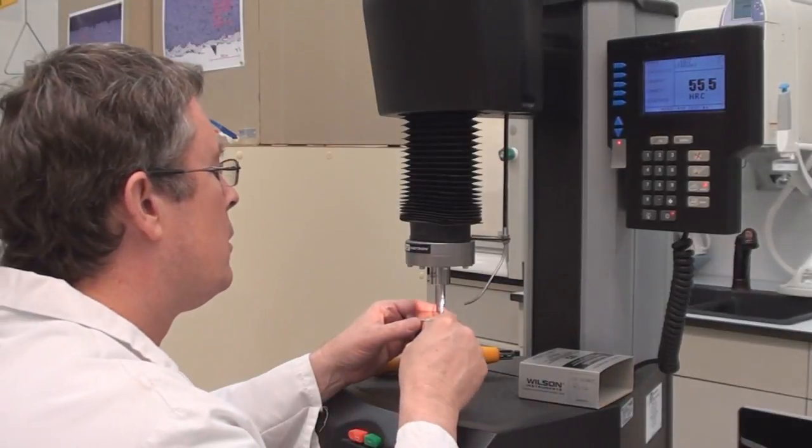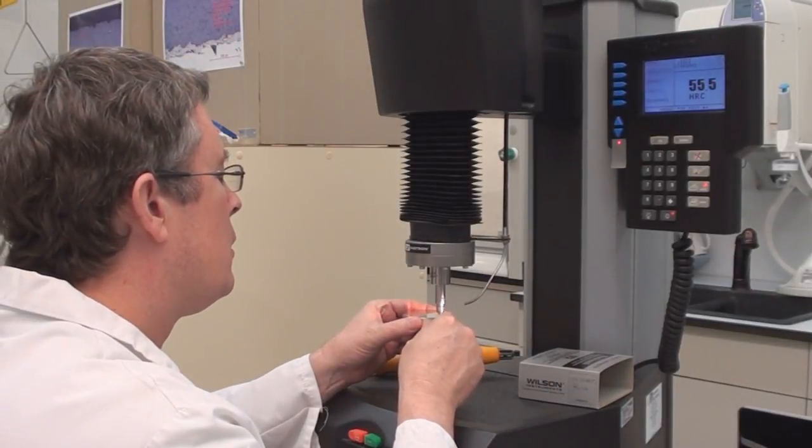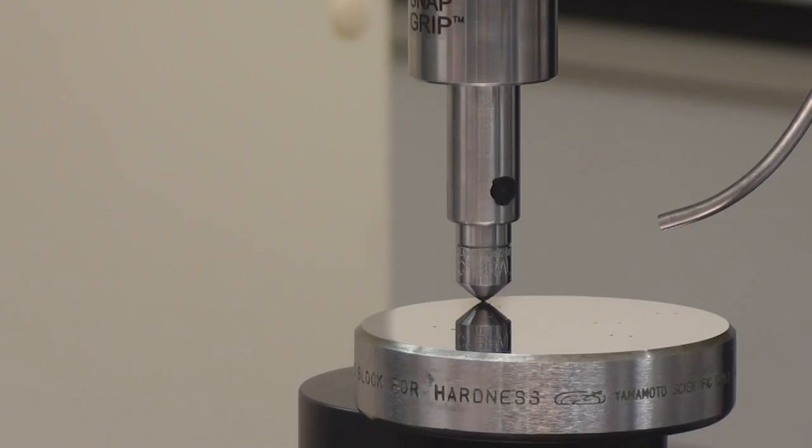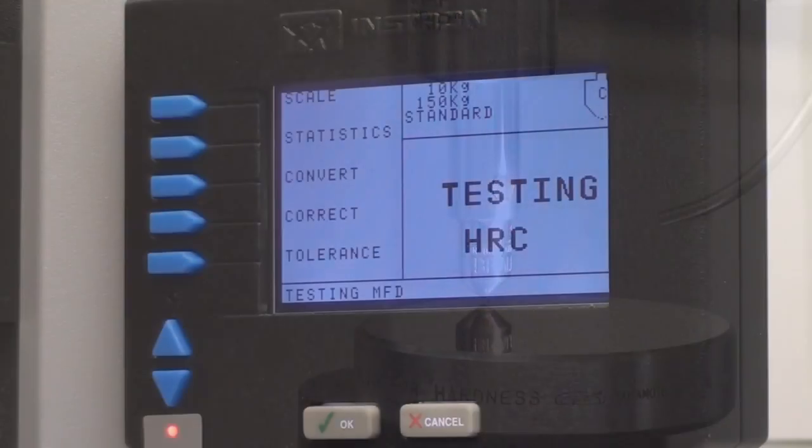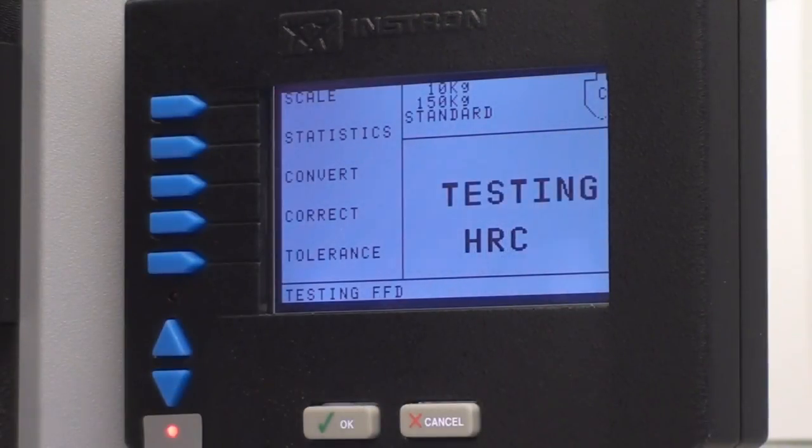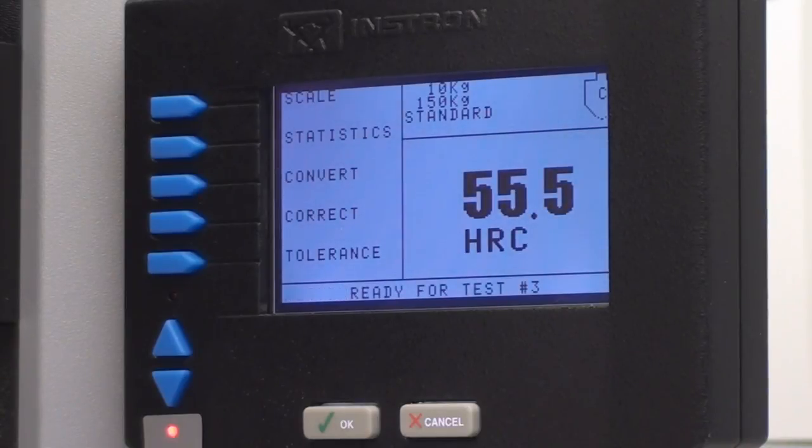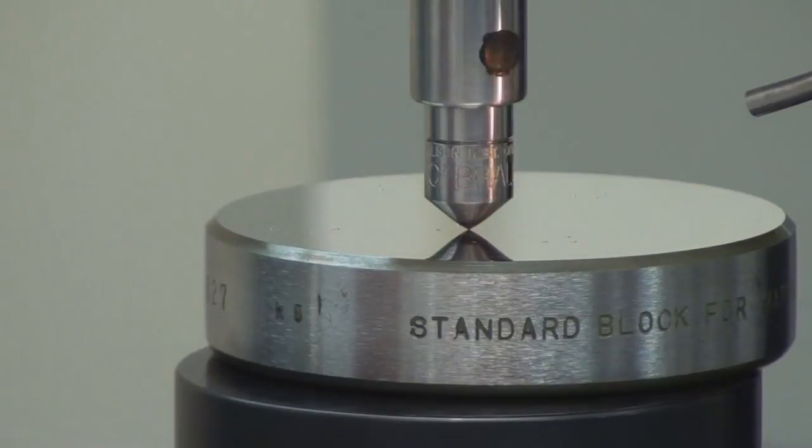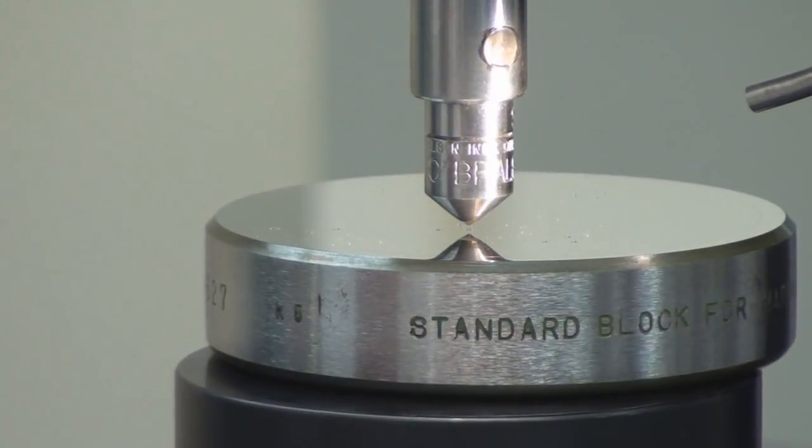The Rockwell hardness test is an indentation hardness test that can provide useful information about substrate materials prior to coating. Here, the Rockwell C hardness value is determined by the depth of penetration of the indenter. The hardness of the substrate is typically customer-driven and should be strong enough to perform its intended purpose. The coating is then applied on top of and is supported by the substrate.